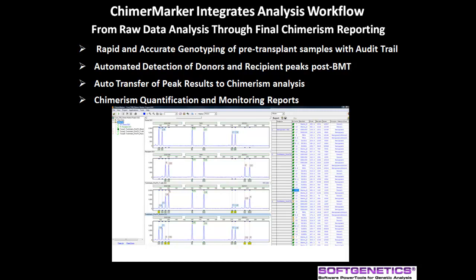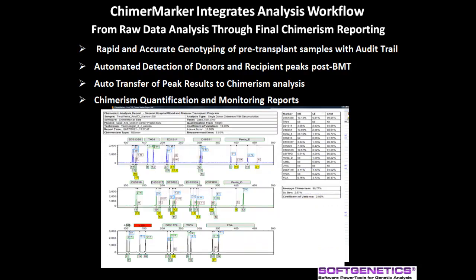The third step is an auto-transfer of peak results to chimerism analysis and chimerism quantification and monitoring reports containing a header with institution, user management, and details of the analysis parameters.